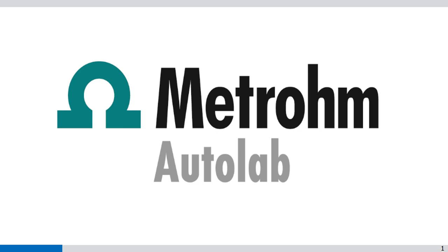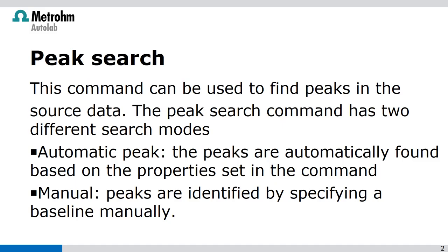Welcome to Nova videos. In this video I'm going to talk about the peak search. This command can be used to find peaks in the source data. The peak search command has two different search modes.